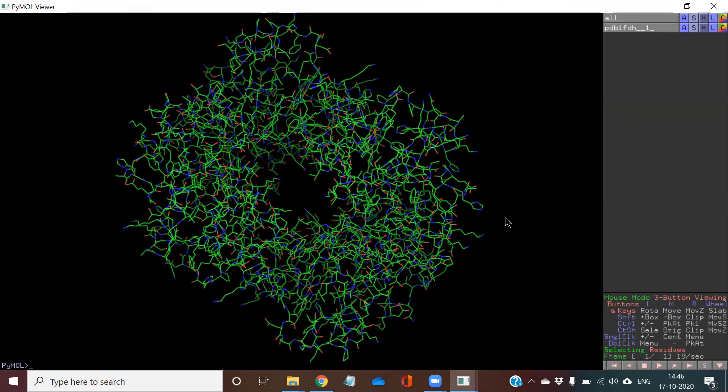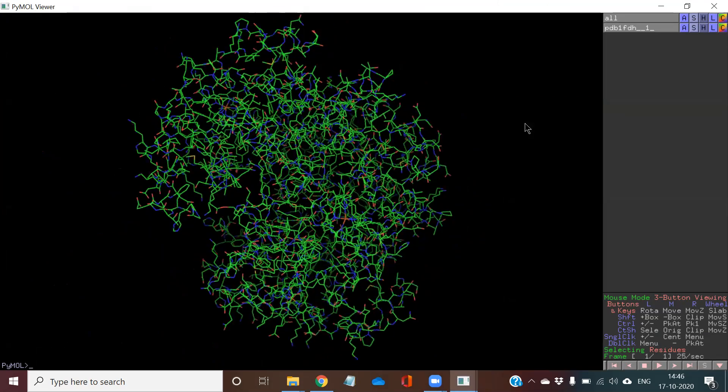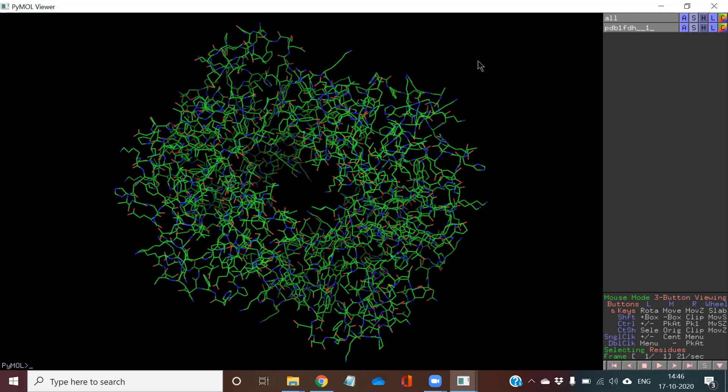Once the software is installed in your laptop, whichever protein structure you are going to download from whichever site, you are able to observe it in your PyMOL software. In PyMOL, this protein structure has been opened. This is the stick model.